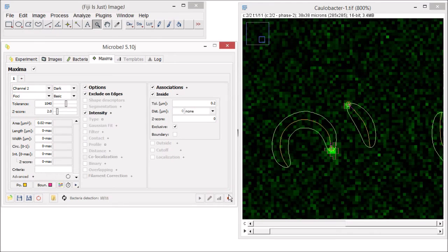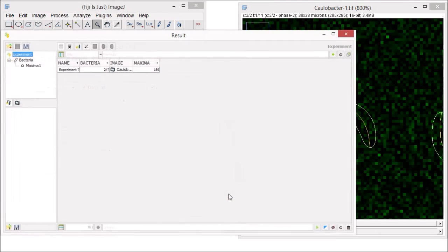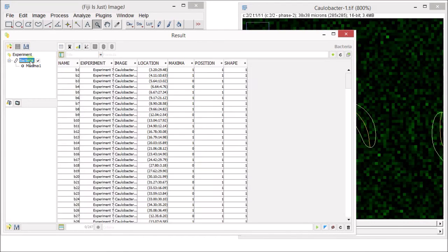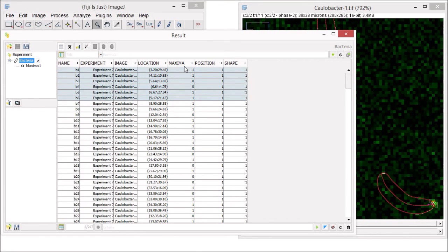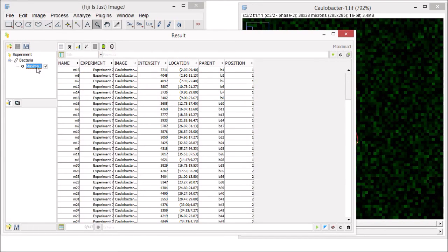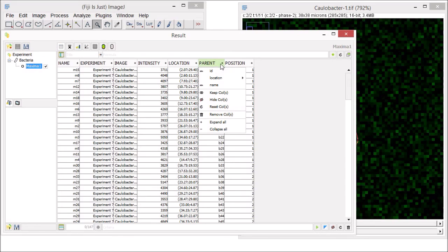Now let's run our experiment and look at our raw data. On the results interface, in the experiment panel, we see a hierarchical arrangement between the bacteria and the maxima we associated with them. Because the bacteria are the primary particle that the maxima are associated to, we refer to bacteria as the parent particle and maxima as the child particle. If we select bacteria from the experiment panel, we can see all the bacteria detected and which ones have maxima and the number of maxima. If we select maxima from the experiment panel, we can see in the data table a column for parent and below it the specific bacteria where the maxima were found.